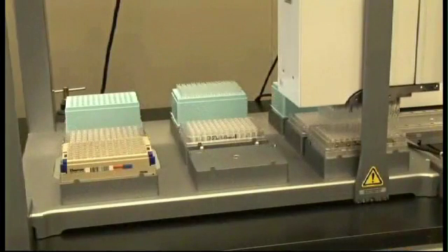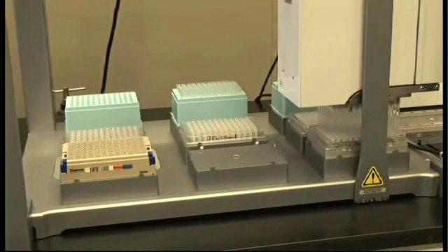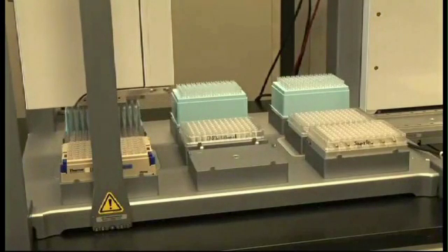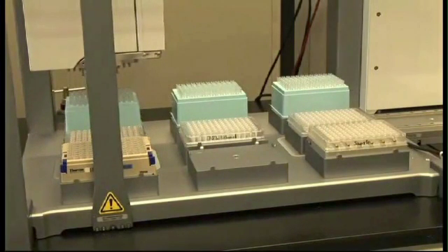After the 3-minute incubation, the Bravo clears the supernatant, which contains any unwanted material, from the beads that are attached to the sides of the well. The supernatant is dispensed into the plate that used to contain our SPRI beads. The advantage of aliquoting reagents into 96-well plates is that it limits sample-to-sample cross-contamination and also allows the user to easily configure the deck and, after the protocol is complete, easily clean up.